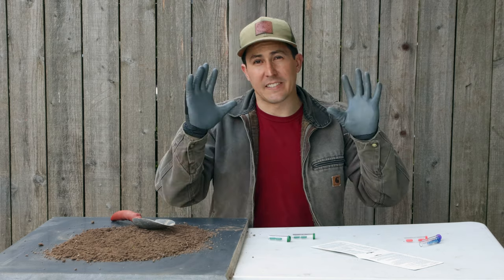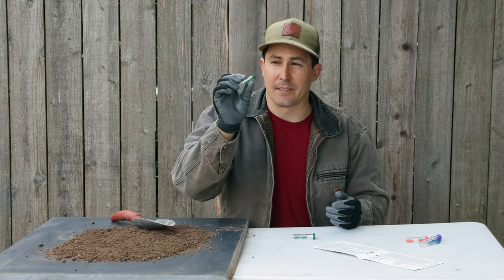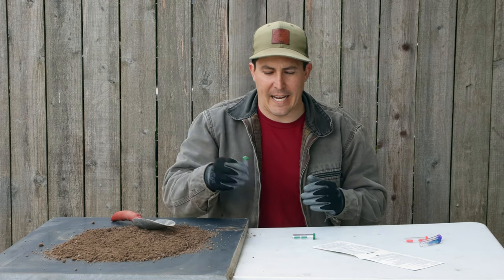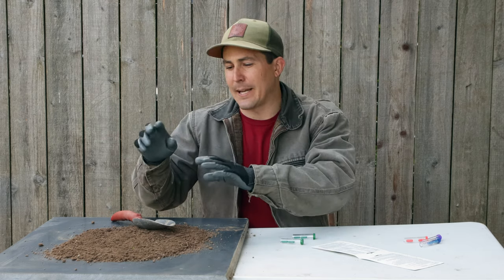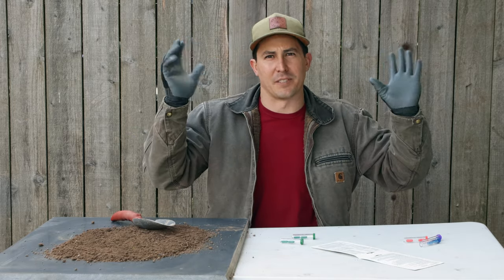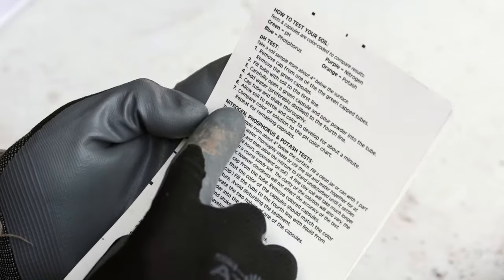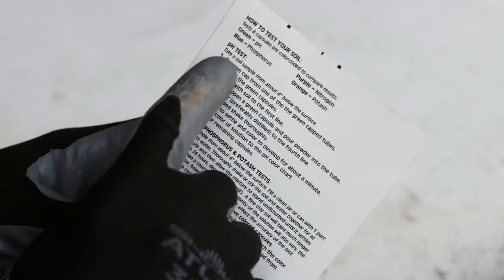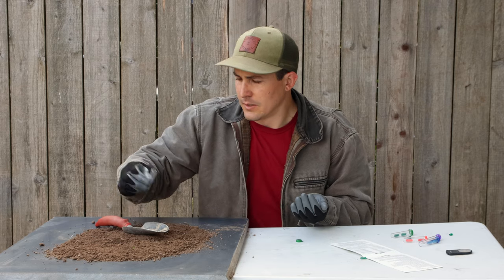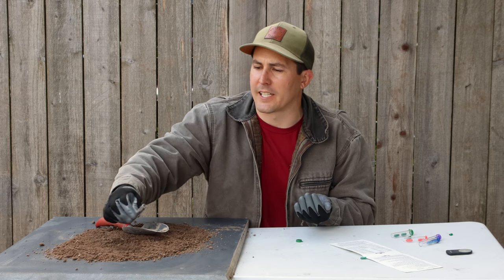It's a good idea to wear gloves any time you're doing these soil tests. I don't know what chemicals are in these, and I don't want to contaminate the soil I'm going to be testing with something that's on my hands — so just wear some gloves. There's one section here for a pH test and a separate section for nitrogen, phosphorus, and potassium. For the pH test I'll need these green capsules. I'm taking soil from different sections of this pile.